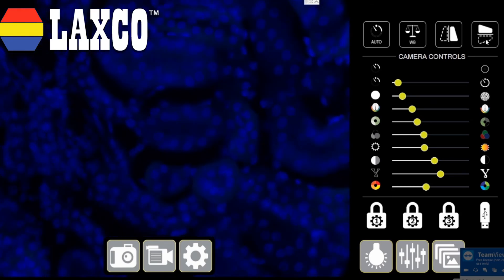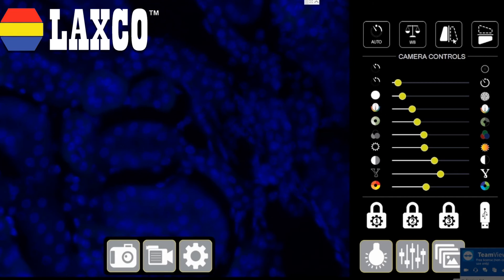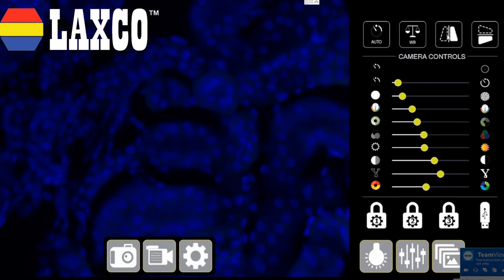This is my image flipping button — I can flip it upside down or side to side, which is pretty handy. This is my white balance button. This is an auto button that allows me to go back to the preset default setting in the software, which is mostly useful for most samples and most dyes. I'd say that's a beginner setting for people who have not worked much on fluorescence. If you hit that, it goes back to the default setting, and then you can always change it manually.